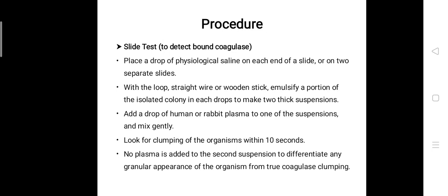One important thing: the section of the test without plasma should still look milky. If this section also develops clumps, then the result cannot be interpreted, and such strains should be further tested with the tube coagulase method.